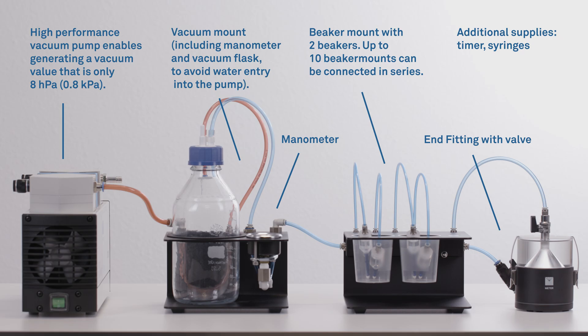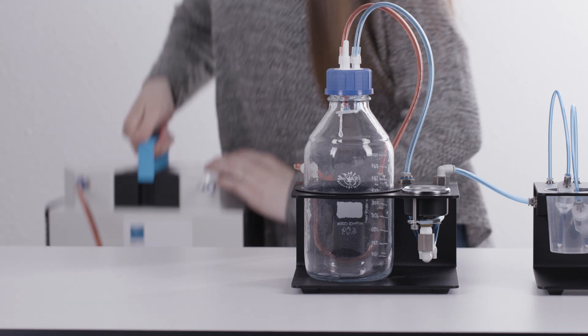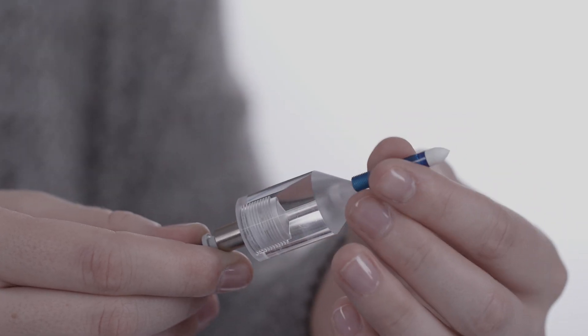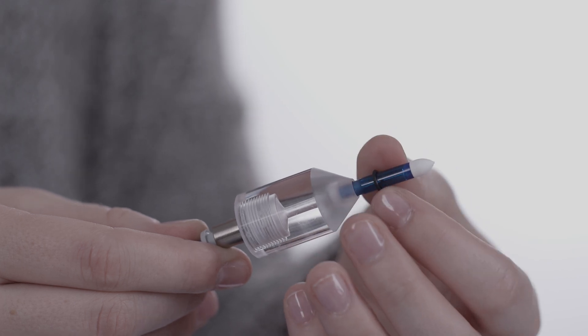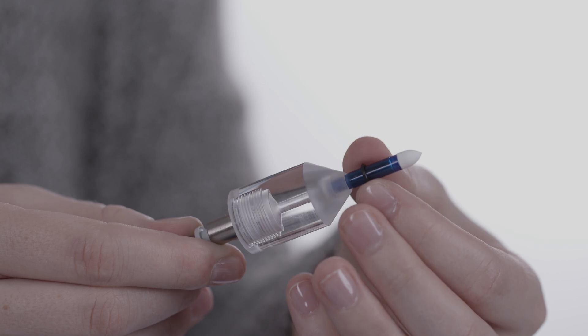For degassing you'll need the following supplies. Put the vacuum pump on the ground where there is a lower temperature to better achieve full vacuum. During the procedure don't touch the ceramic of the tensio shafts with bare fingers. Grease or soap reduces the hydrophilic characteristics of the ceramic.